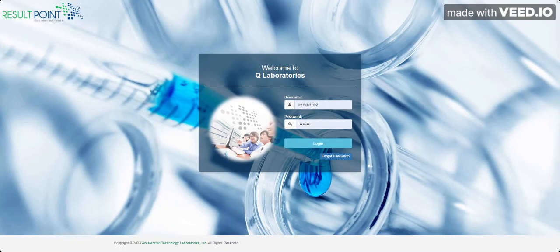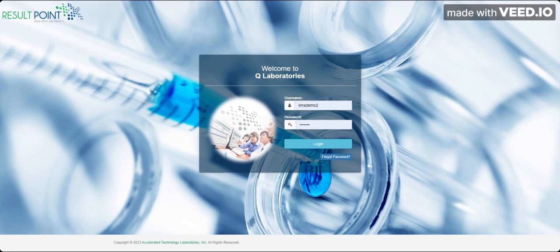This video is to show you how to use the Result Point portal to view and request samples and results. Feel free to pause or go back at any time throughout the video to help you better understand this process. Let's start by logging in and navigating to the homepage.